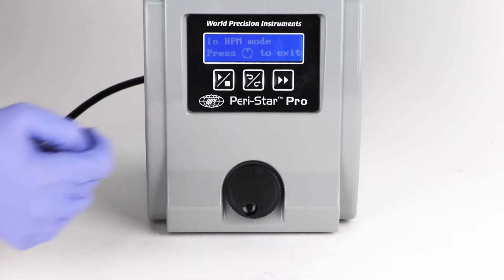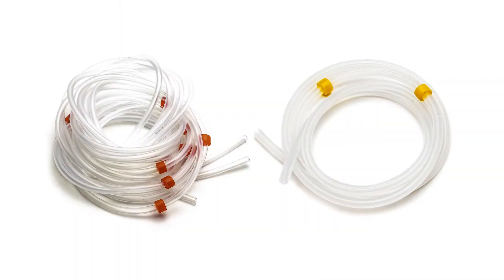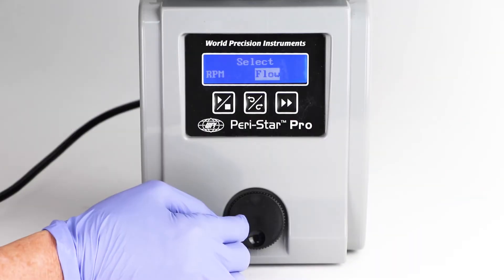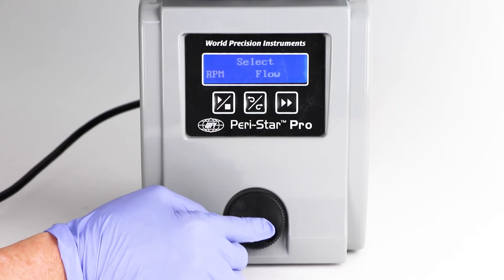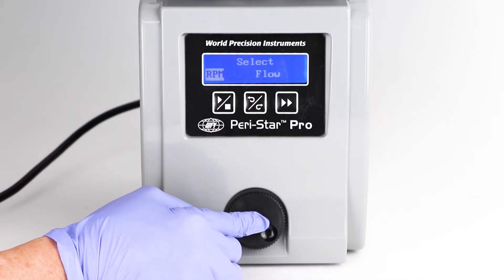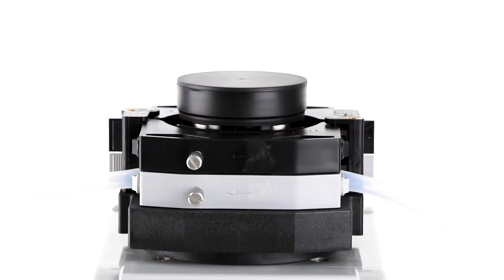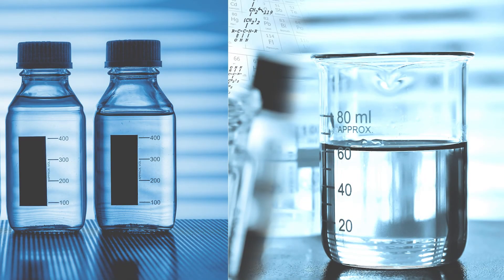Calibration is the first function of the main menu. This function calibrates the flow rate of the current tubing. The calibration menu is only available when the pump is in flow mode. In rate per minute (RPM) mode, there is no need for calibration. Calibration can be done by pumping the fluid into a volumetric container in a specified time.